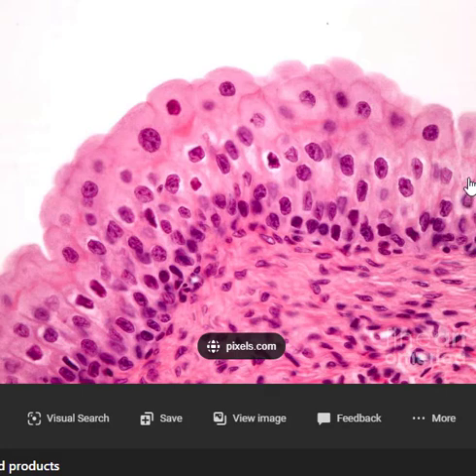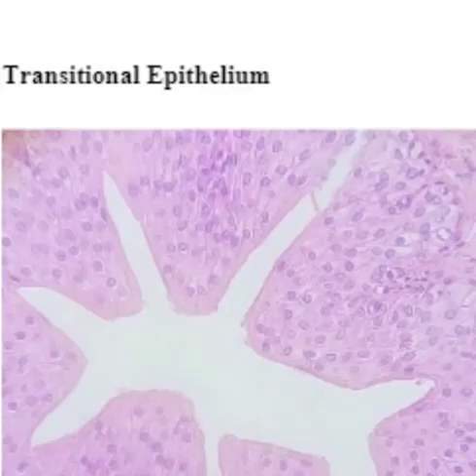But when they're shriveled up like this, because your bladder has shrunk, I think it looks like peacock's tails. You can see a peacock's tail there, and there. But in your mind, just take these cells and pull them out, stretch them out, and you'll see them look like the columnar cells we have seen before.